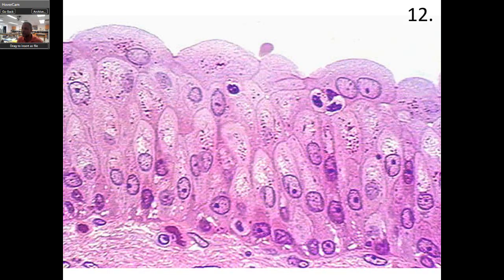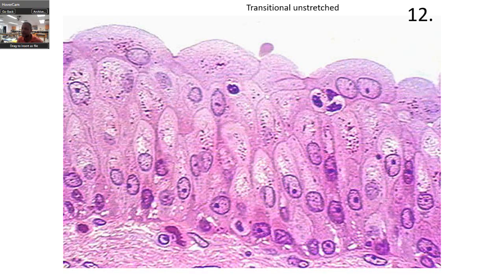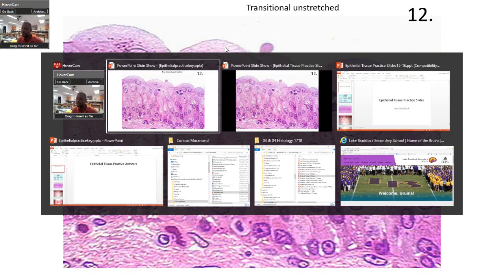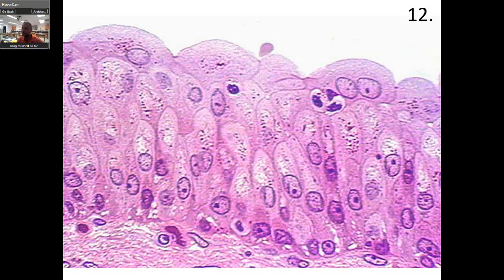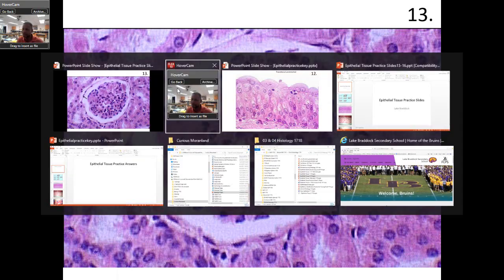What do you think that is? Transitional, unstretched again. You can see the dome cells up here.